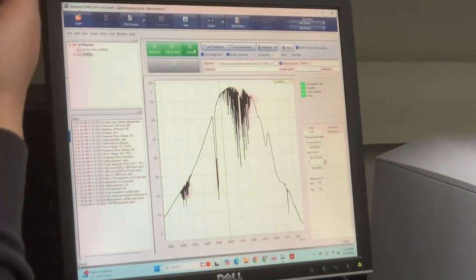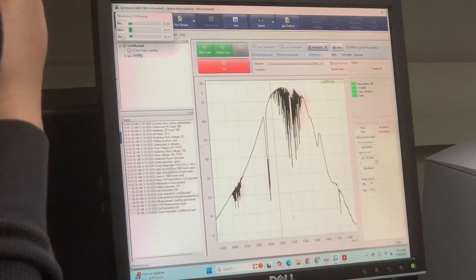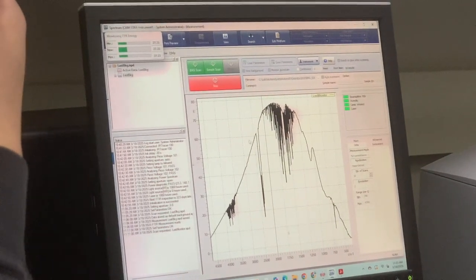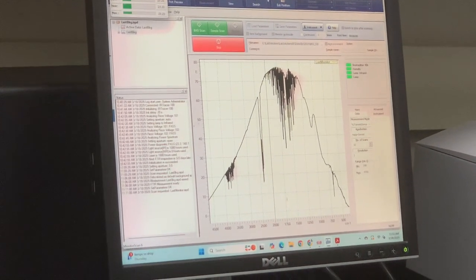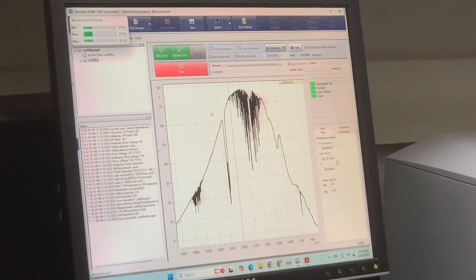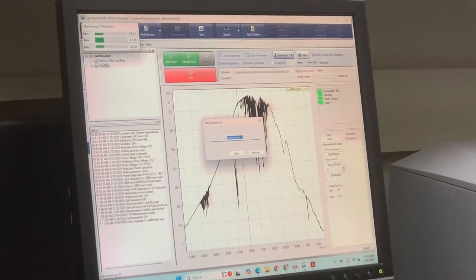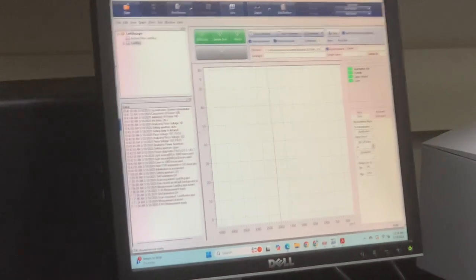So if we were to click monitor, it's monitoring it. That way I can just watch and then switch the screen. Oh, there's the energy that's transmitted. Is it changing the mode? It's not transmitting now. I think it's just going to keep doing this. It's blinking, I think it's just taking a photo of it. Yeah, that's a beautiful function. I should have done that. I was just going to send it to Kevin so that he can upload it to YouTube.